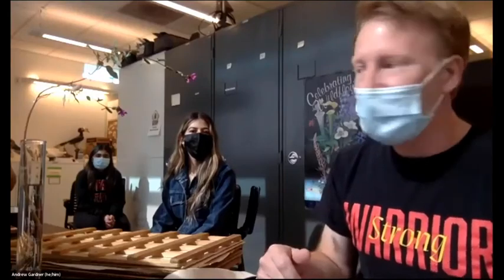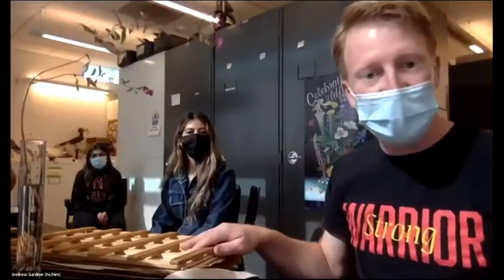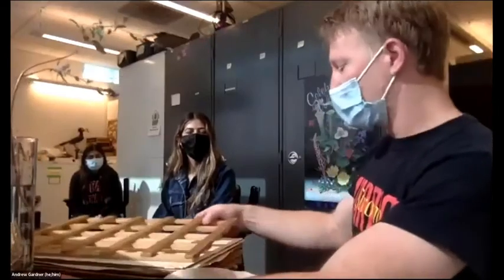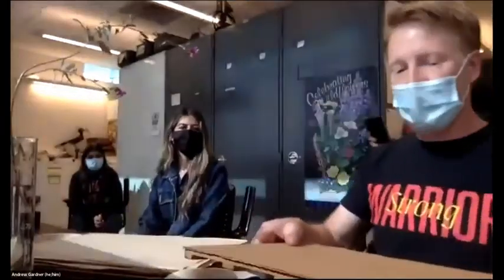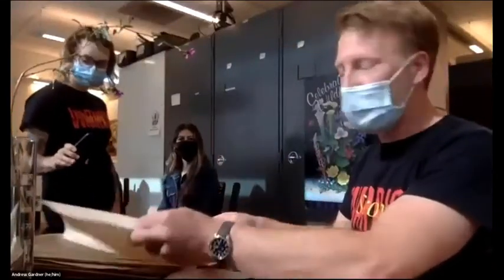So once you've collected your plant, like this little Clarkia here, then you can press it. We'll press ours in this press, but you could do it in a book or something like that. So here we go. We just need to open it up. And then what we're going to do is put it within the paper.